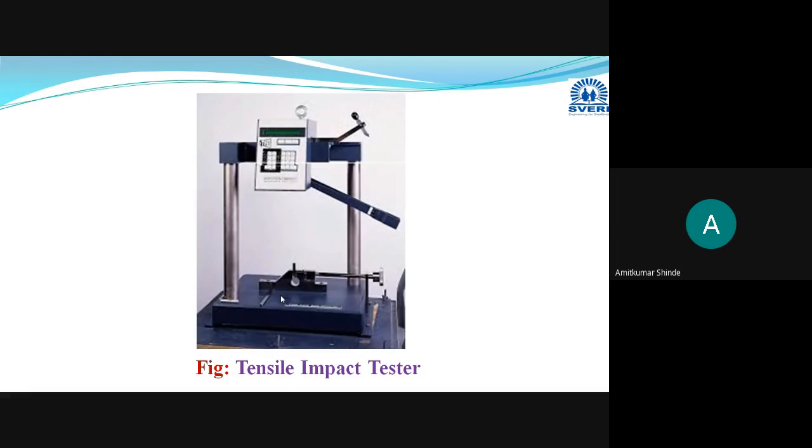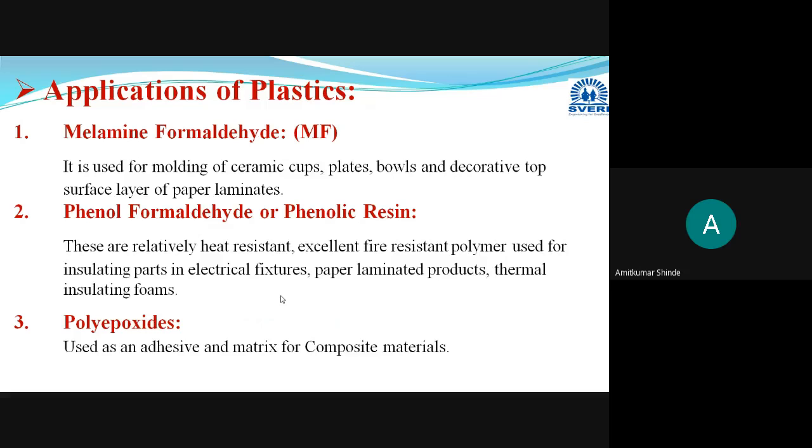Already I have completed it, but I have collected some more information related to the specimen preparation, and some schematic arrangements of testers used. This is the digital tester. Now we will move towards the next part, applications of the plastics.